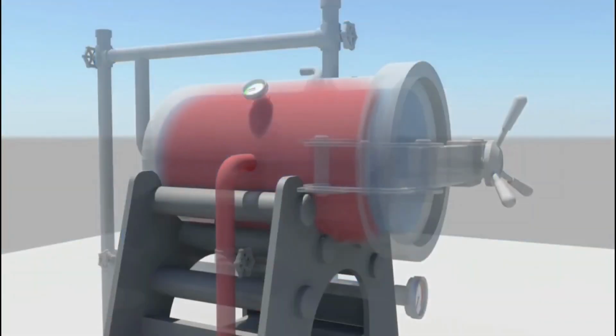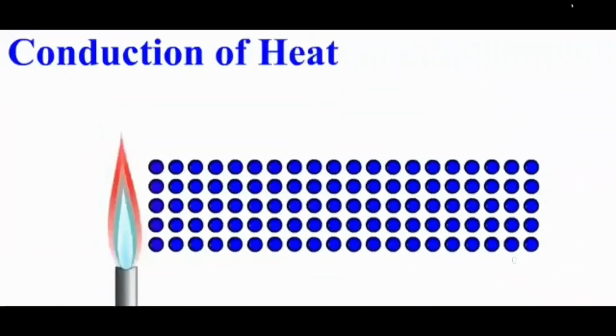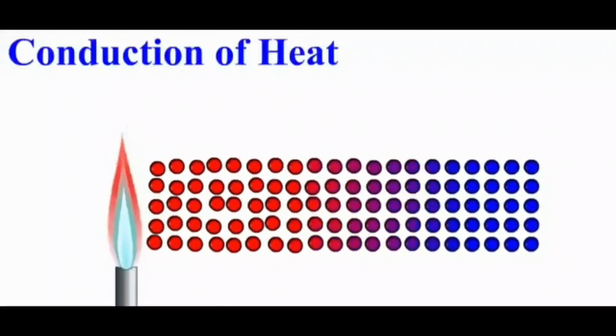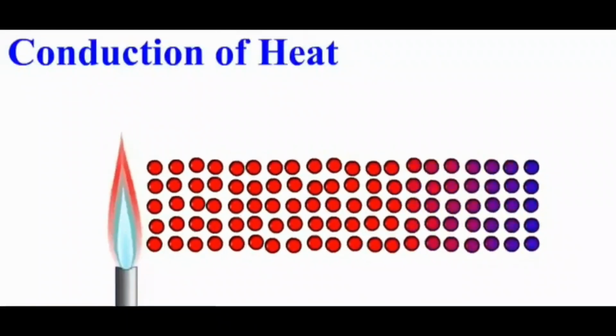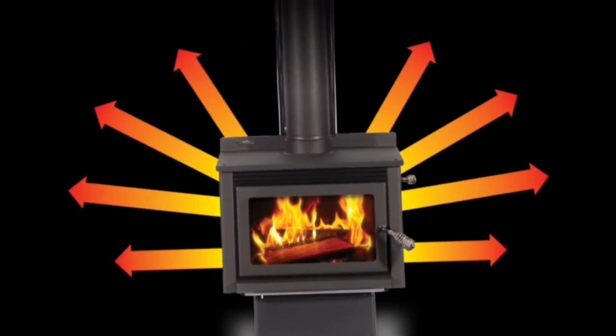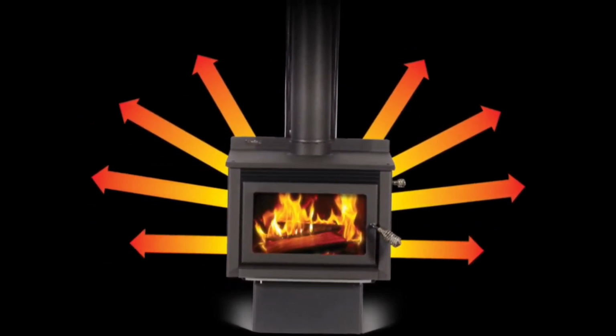As steam engulfs the jacket and the chamber along with the materials being sterilized, conduction is observed, where heat slowly penetrates the outer surface exposed to the heat and then the next layer until the entire material reaches the proper temperature for sterilization. As the steam circulates to distribute the heat, it creates a convection current that helps maintain consistent temperature and pressure. Afterwards, as the autoclave operates to sterilize the items inside, some heat may be lost through infrared radiation from the hot surface.